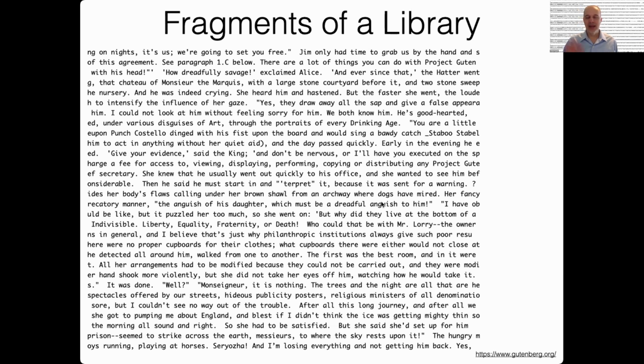And so I'll just tell you that's kind of like a simple algorithm. I think that anyone who knows a little bit of programming could probably write that algorithm. It's not particularly efficient in terms of speed or other resources, but it would work. If you want to do it faster, computer scientists have spent decades thinking up better algorithms to search for given texts in a larger database of text. And so there are faster ways to do that.